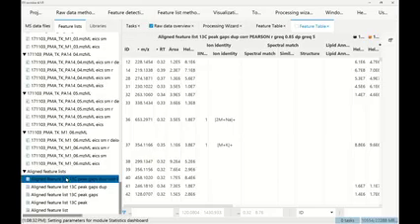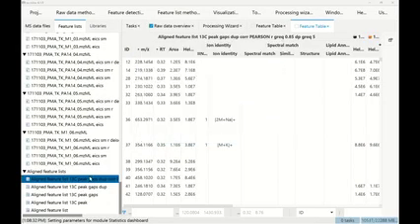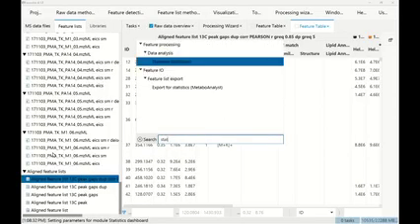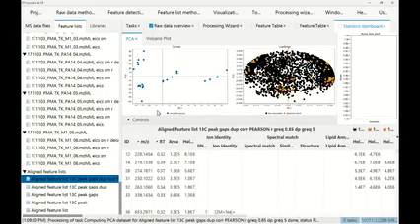And one thing that you can do now is just double shift or Control F. So like in any other tool, Control F to search for something, and then we're searching for statistics dashboard. And then we can just open it by hitting OK.